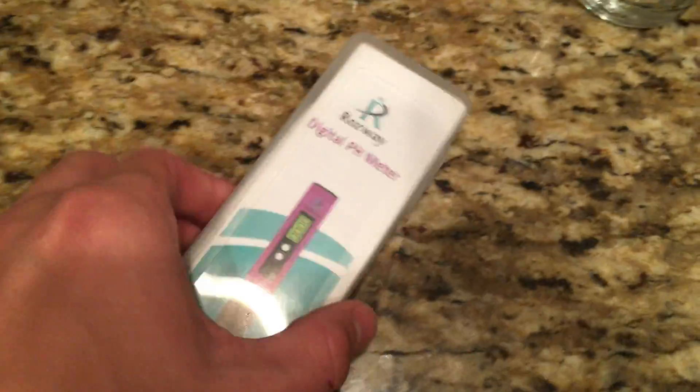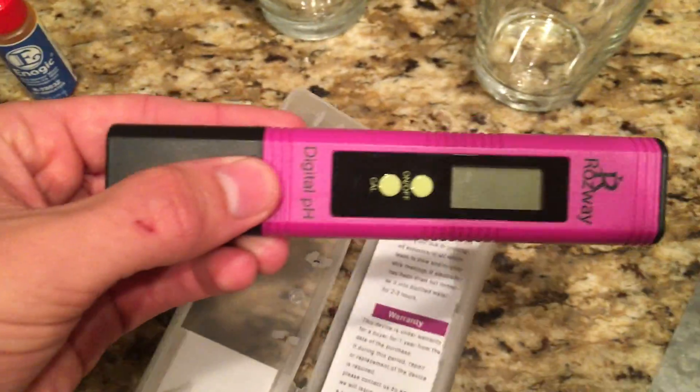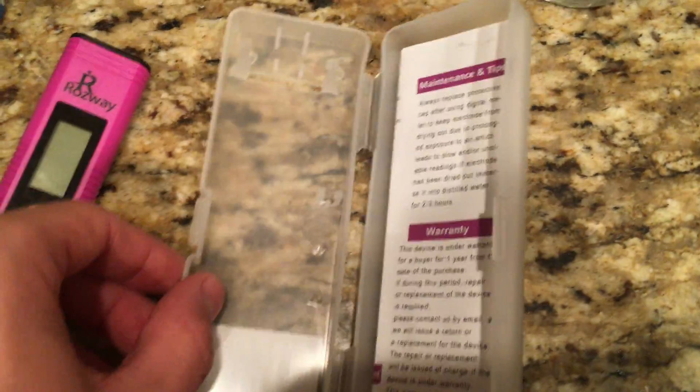This is what it comes in. Some buffers — we don't need those. Here's the product, instructions, how to calibrate. It says it already comes calibrated.